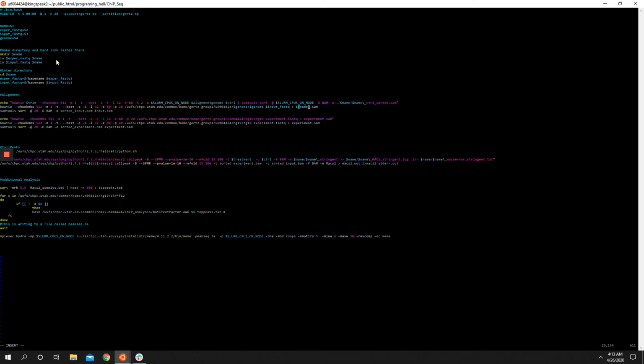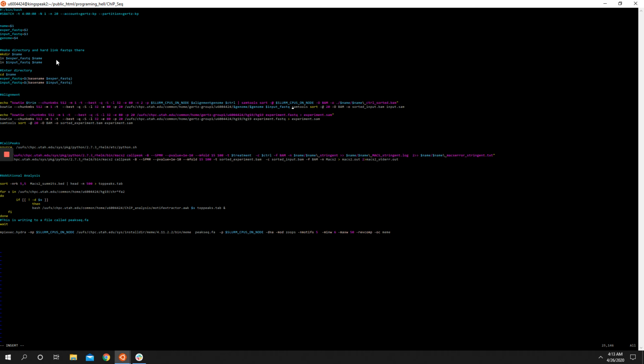And I told you that we can use pipes to avoid having intermediate files, so we're going to do that right here. We bring up the next line and pipe the standard out into samtools, and it'll sort as we do that, so we don't need that input.sam.